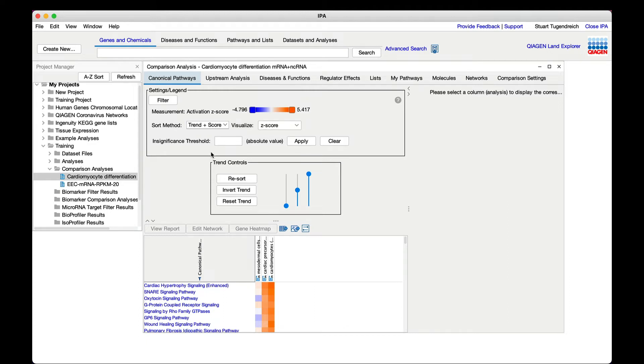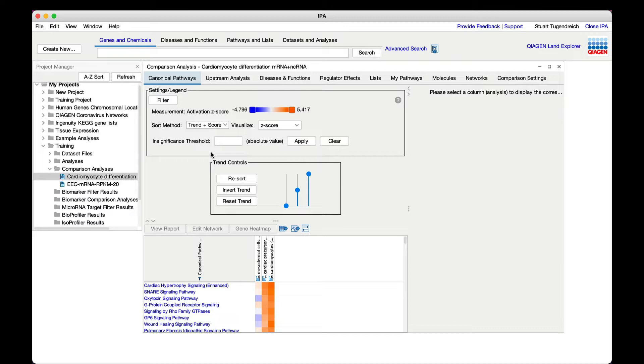How can you find biological predictions that trend in a time-dependent manner during the differentiation program? Up until now, we have focused on just one of the analyses and contrasted it to the other two. We examined in detail a few genes and their associated functions of interest across those analyses.